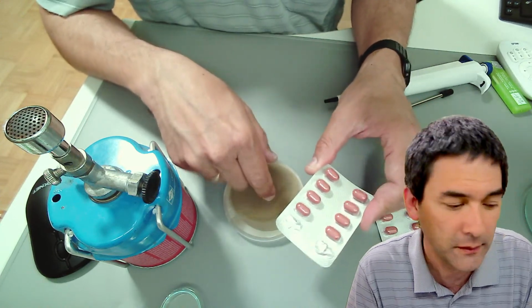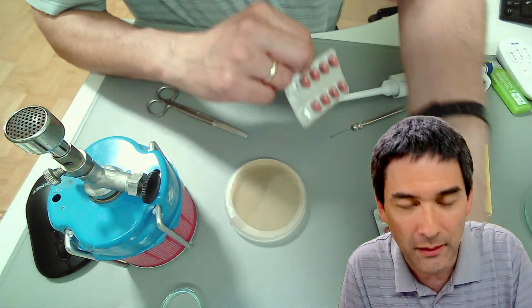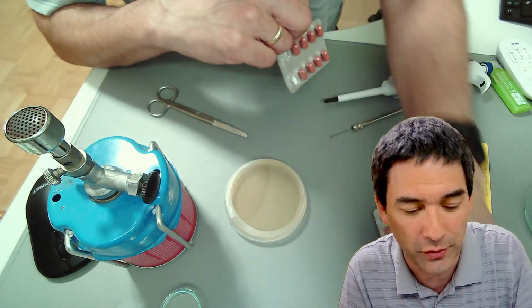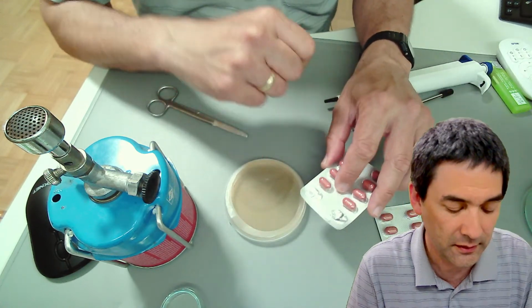What I'm going to do is simply grow those freeze-dried bacteria on a Petri dish. Then you have to wait 2 days, and because we do not want to wait 2 days, I've got a ready-made one over here as well. So this is basically the thing here.